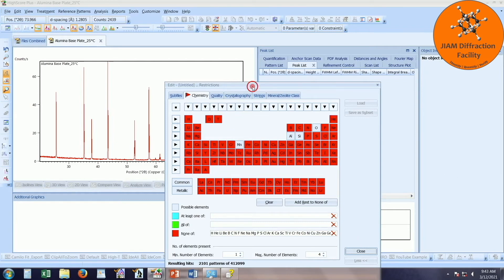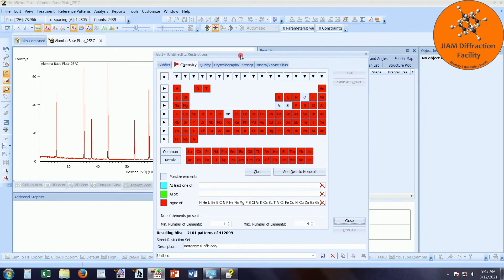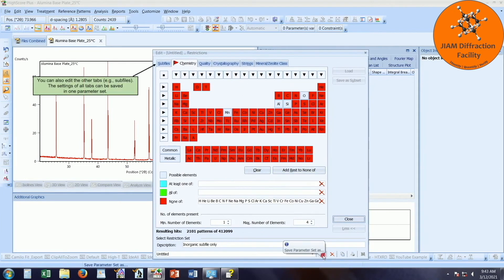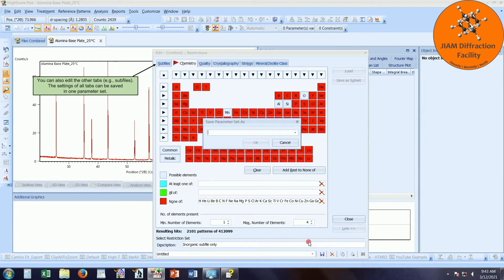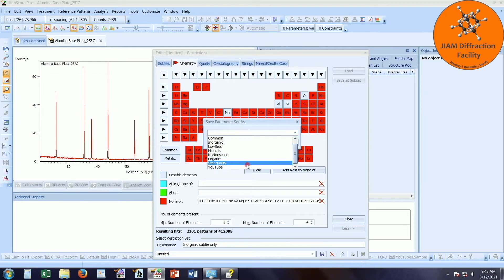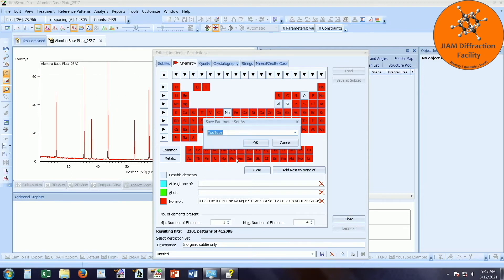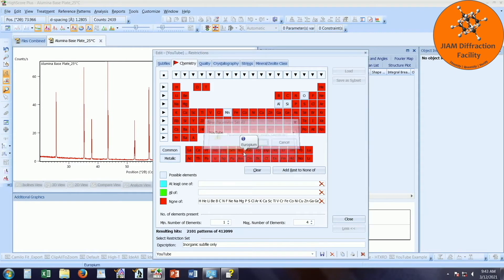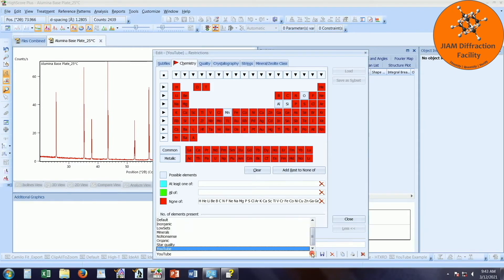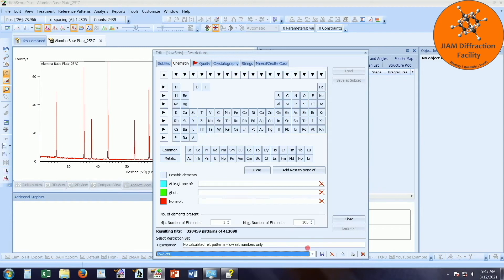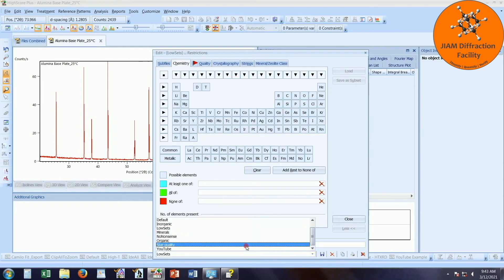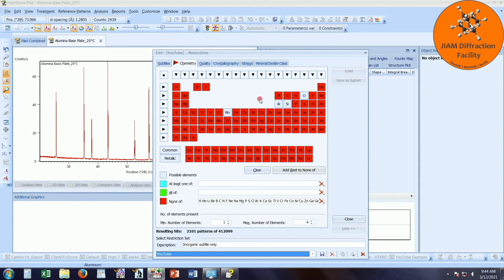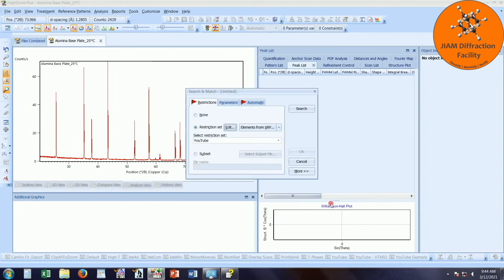If I want, I can drag this up and save these parameters as another parameter set. So I will left click, I will choose YouTube, click OK, and OK again. And you can see that even if I clicked away from this and chose something else, if I went back to YouTube, it restores all of my settings. So I will close.